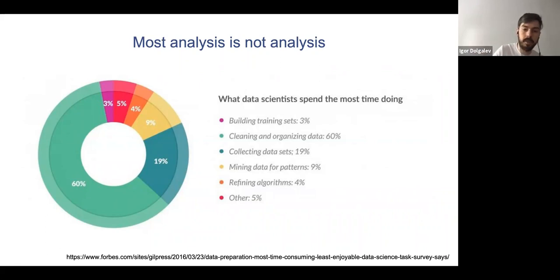For sequencing, maybe you're not collecting the data that much as an analyst, but there's still a lot of cleaning and organizing data, and also quality control. Just because you have a FASTQ doesn't mean it's actually any good. So I would say the most important part is not just the basic workflow, but also making sure you're confident in all the steps and in the actual data. That's a little harder to cover in a very basic workflow.